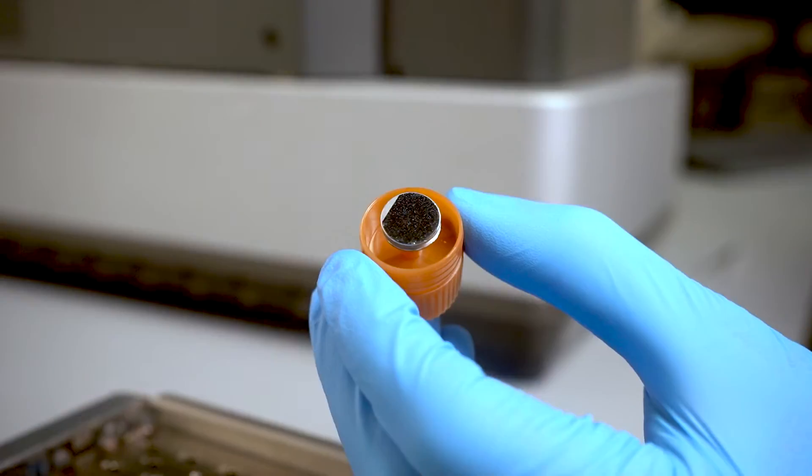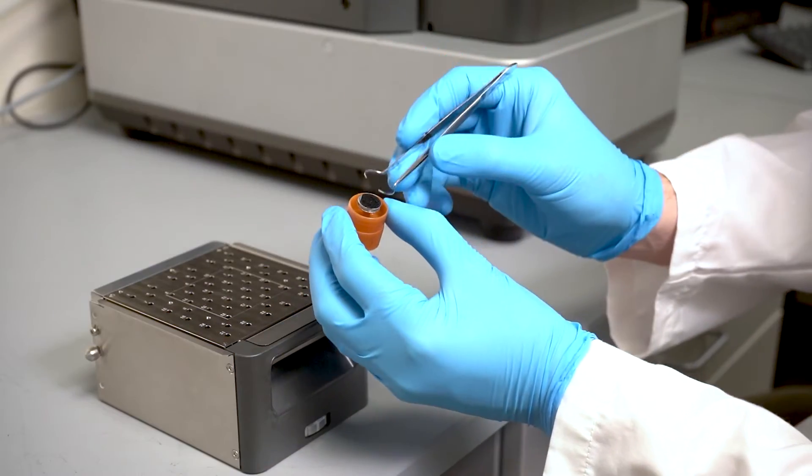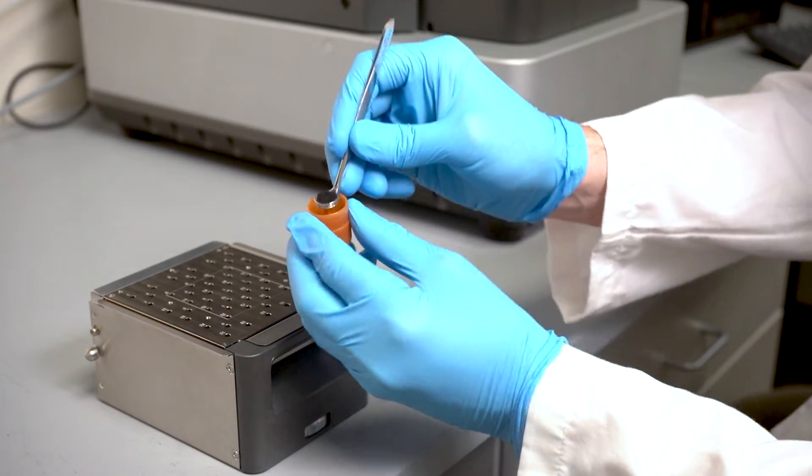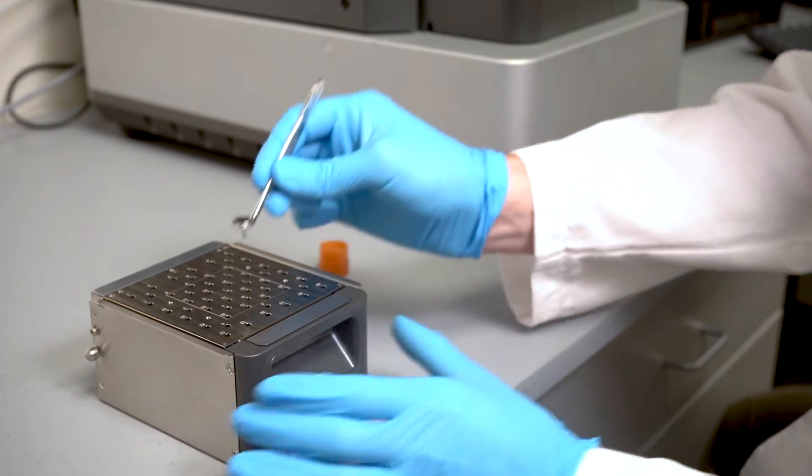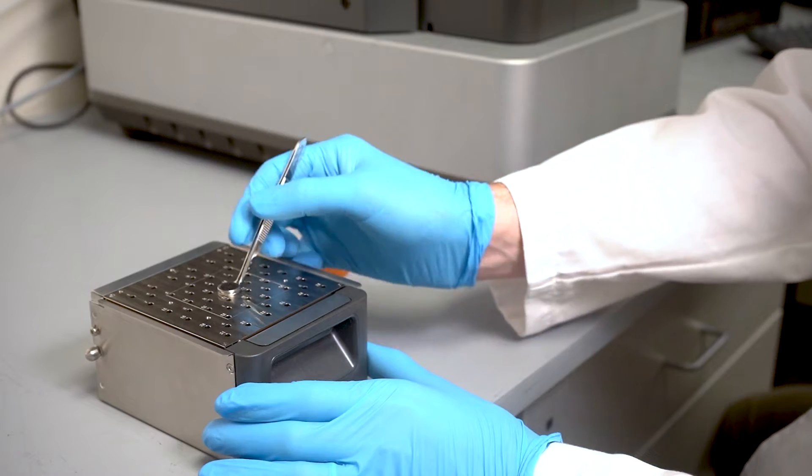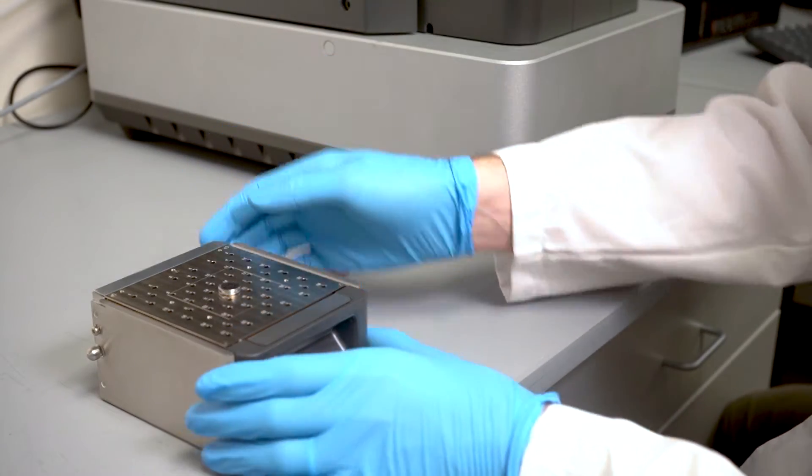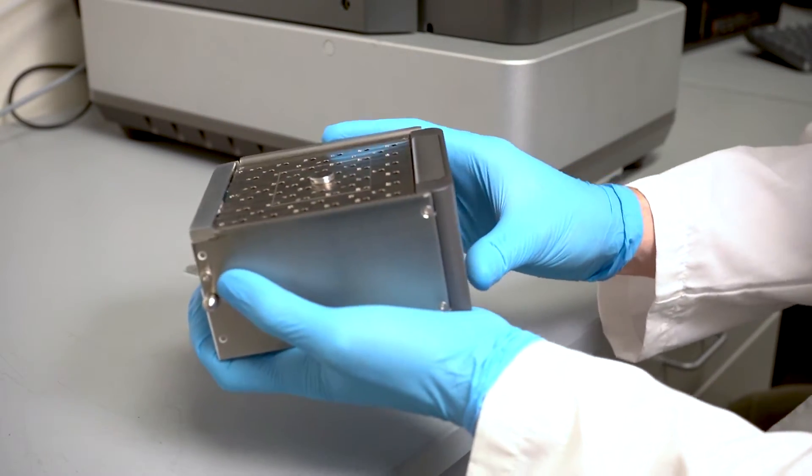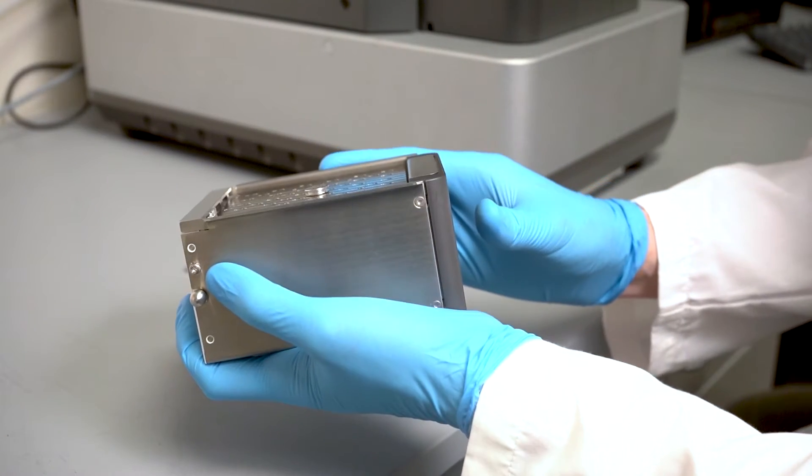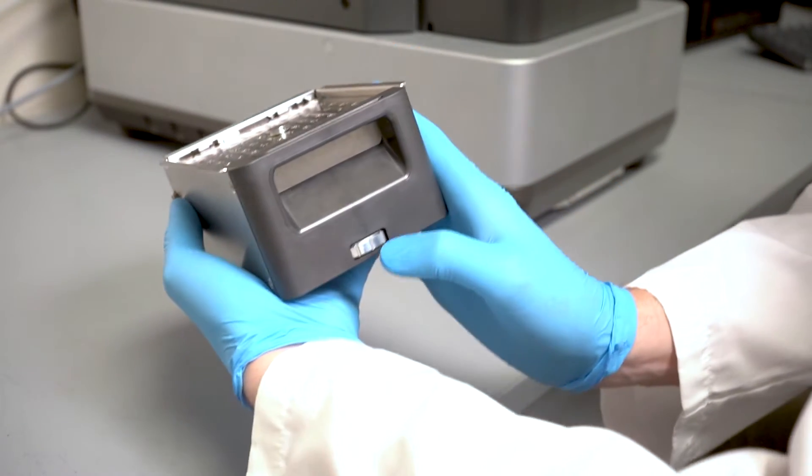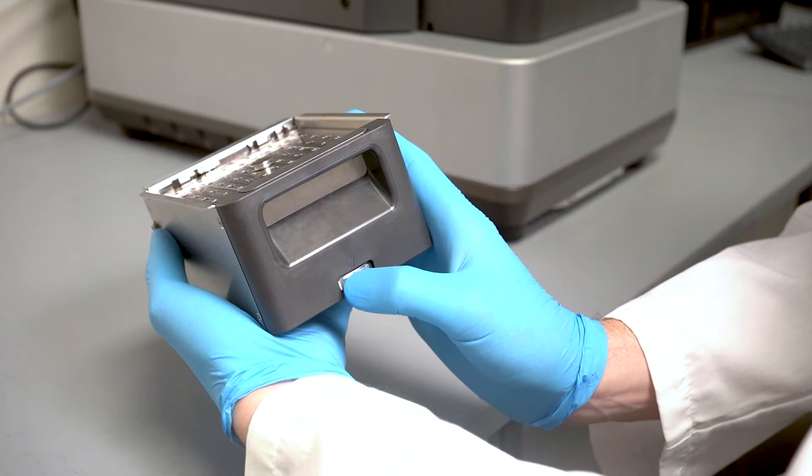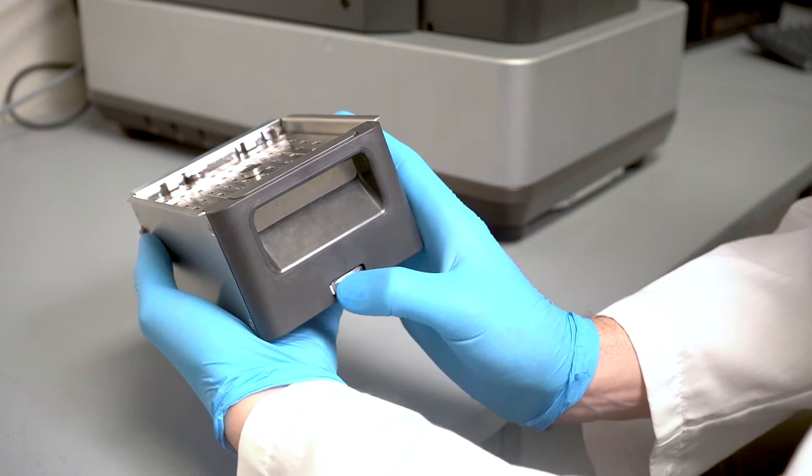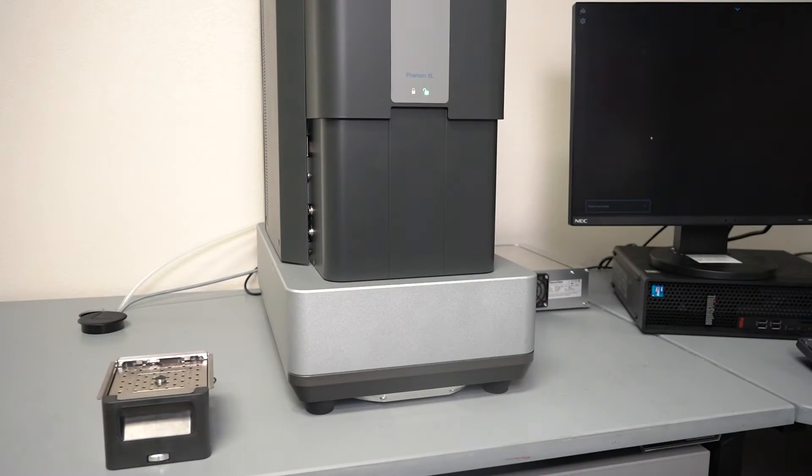I have a sample here on a half inch aluminum stub which I can simply pick up with tweezers and place into the stage, and now I will adjust the working distance just by rotating the knob on the front. I simply want to align the sample flush with the edge of the stage and then move it down by seven or eight notches to achieve an ideal working distance.